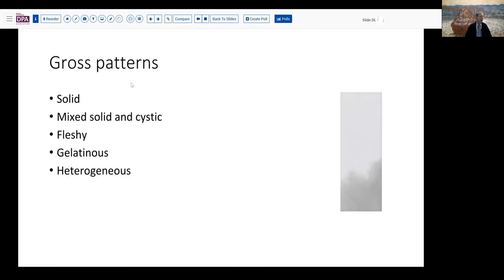Let's take a look at some of the gross patterns we can encounter in ovarian tumors. I think primarily of these five patterns: solid, mixed solid and cystic, fleshy, gelatinous, and heterogeneous — kind of a mixed bag of everything.